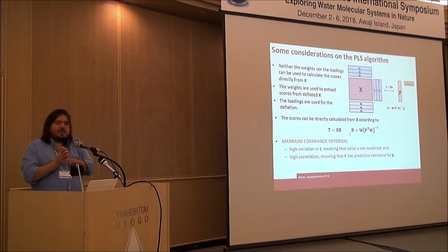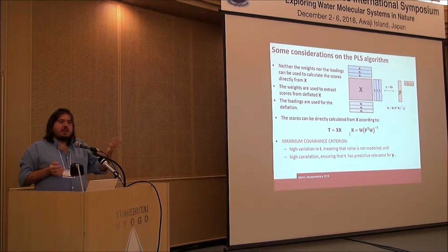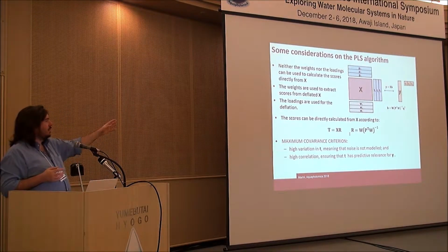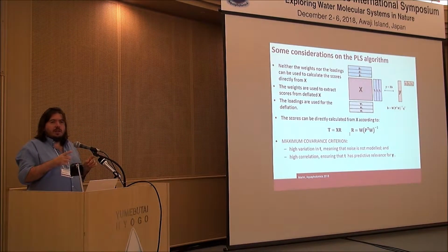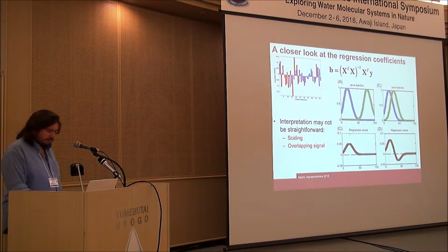So far, for instance, this is the alternative that has been used when discussing the application of PLS in aquaphotomics to define the water patterns and the water coordinates. But sometimes it could be of interest to look into the difference, for instance, into the individual loading weights or loadings themselves to try to inspect the model parameters.